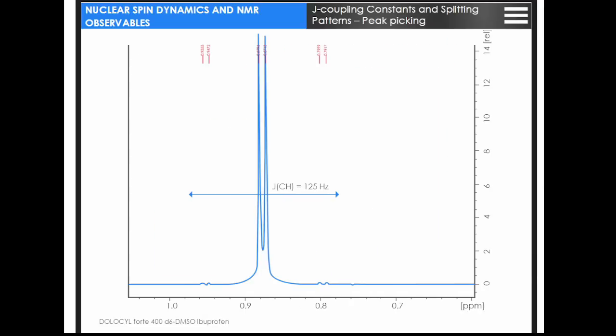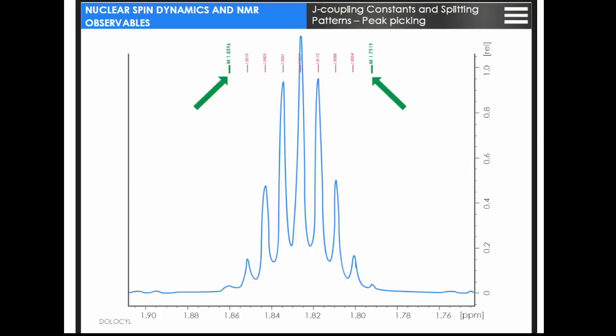The resulting peaks are to be further refined by manual inspection, during which non-relevant picked peaks are discarded. In this case, the two doublets flanking the main doublet stem from the methyl moieties containing the 13C isotope of carbon, resulting in J-coupled splitting of 125 Hz. Carbon-13 is a natural stable isotope of carbon. It is one of the environmental isotopes, making up about 1.1% of all natural carbon on Earth. And missed peaks have to be added manually, shown in green.